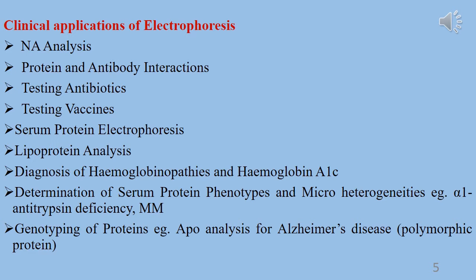Second, protein and antibody interactions. Another common form of electrophoresis is immunoelectrophoresis, which analyzes the presence and behavior of certain proteins. Many medical conditions, including multiple sclerosis, kidney disease, and some cancers, result in the creation of abnormal protein molecules. These molecules can be detected by performing electrophoresis on urine or blood samples and watching for any variance from the normal quantities and types of protein.